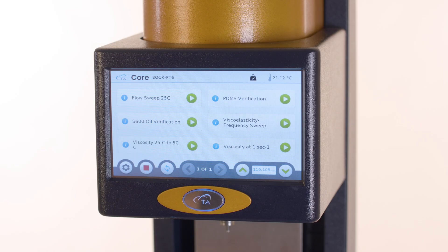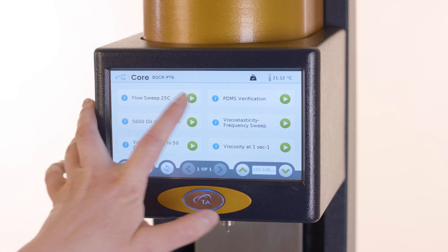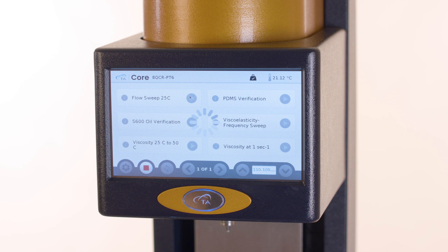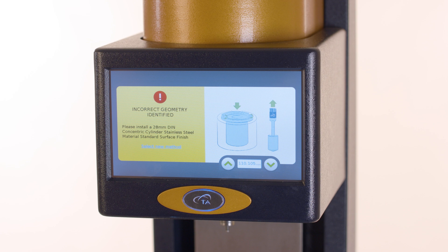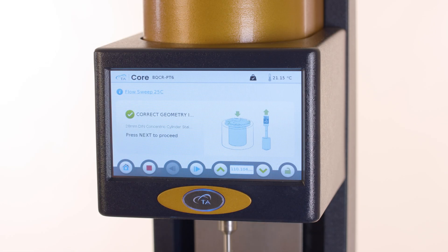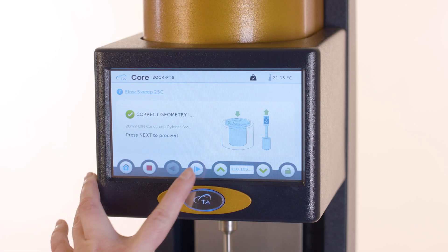On the RayoGuide home screen, select the desired method. The software first verifies that the correct geometry is installed. If an incorrect geometry is installed, then the incorrect geometry error appears on the screen and specifies which geometry should be loaded. After the correct geometry is installed, press next to proceed.